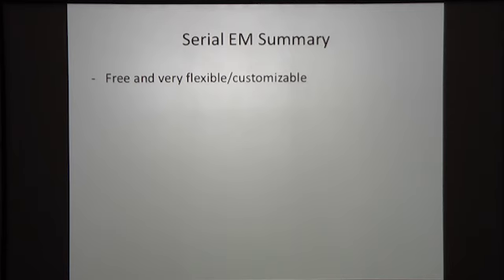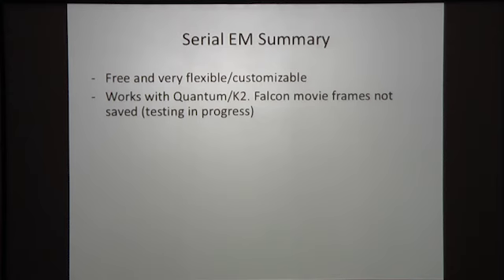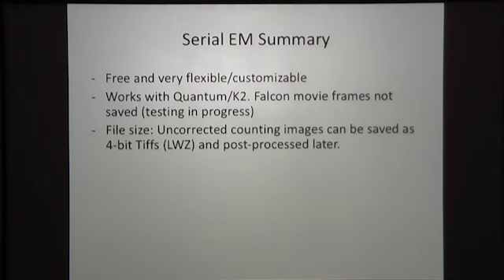Serial-EM is free. That's a big plus. It's very flexible and customizable, and there's great support from David Mastronarde, who developed this software. You can even pay a bit of money to support Serial-EM, but even if you don't, there's a Serial-EM discussion group, and David often replies within an hour of asking a question. It works with the K2 and the energy filter. It will start working again with the Falcon, because FEI changed the way they save the frames and it stopped working. David is working on a solution now.